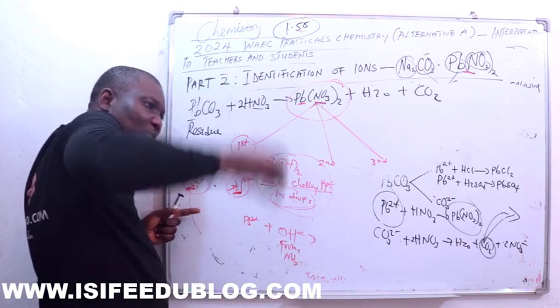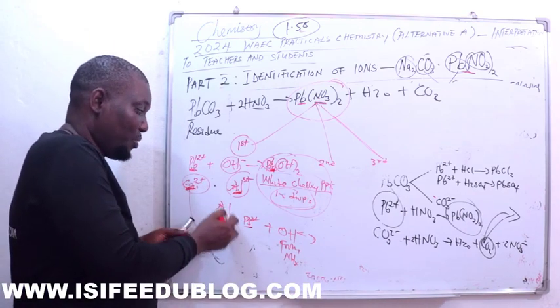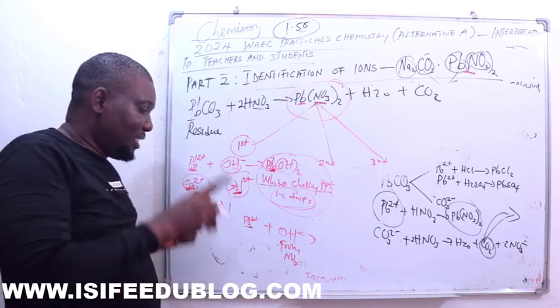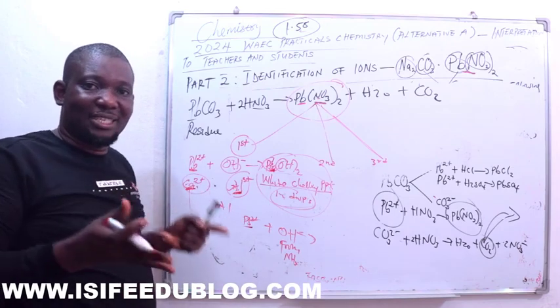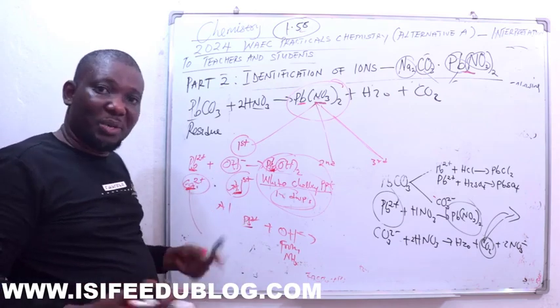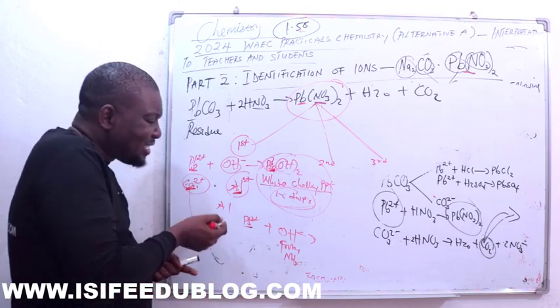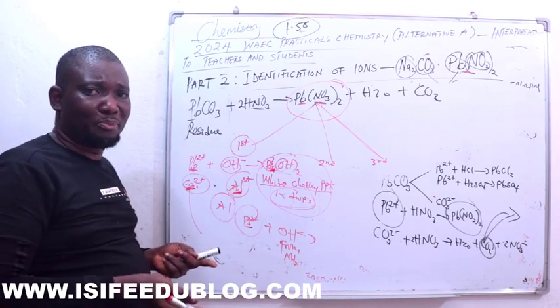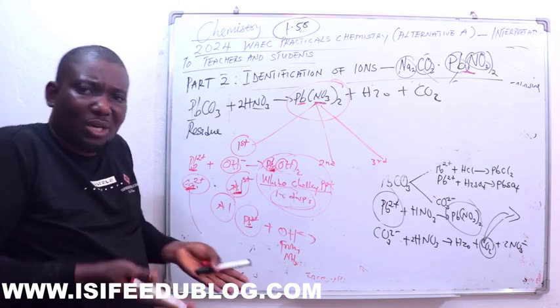But the precipitate is insoluble in excess ammonia, since lead and aluminum do not form complexes with ammonia, being that they are not d-block elements. So the precipitate will just persist and cannot dissolve. At that same stage, you must still be suspecting the two of them. They are going head to head at this point, and it's confusing. It doesn't mean that two cations will be present.